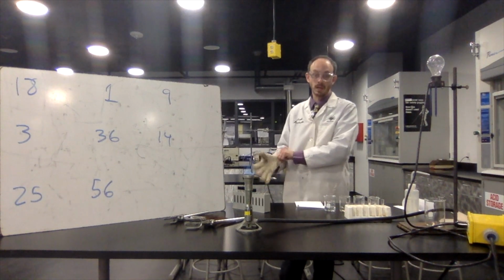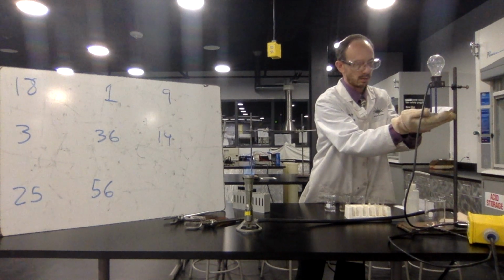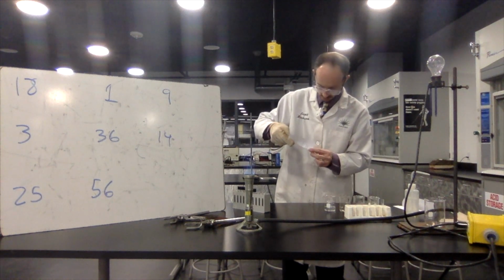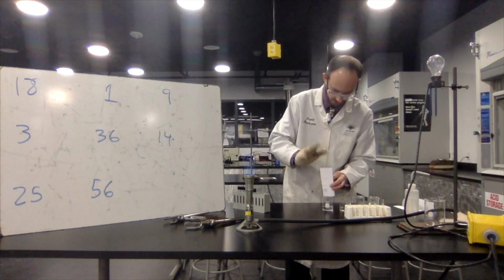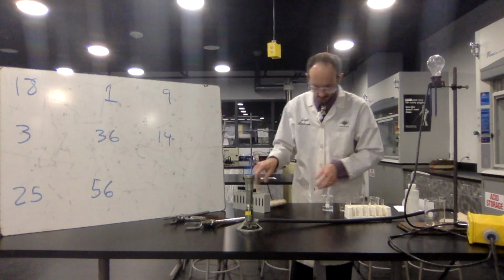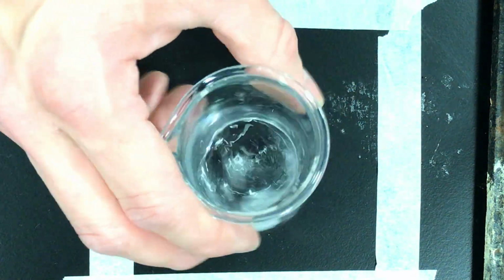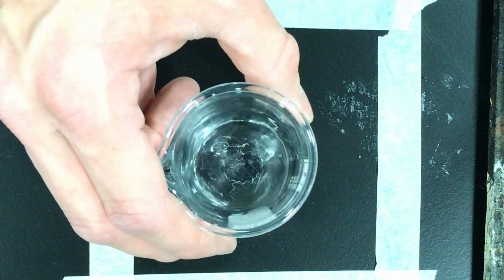And now I'm going to put on my glove and nada. Okay. So now I'm going to put some of that inside of this. Okay, that's enough for a melt test. The rest of it inside of here. And swirl along the way. And there is a lot less inside of there than what I initially put inside of that container. In fact, the more I swirl, the see there's less and less that's there.